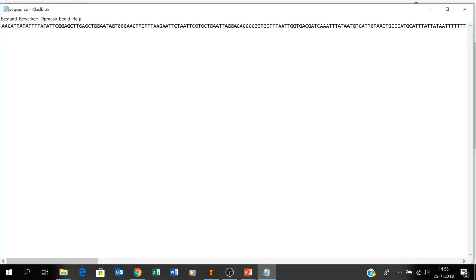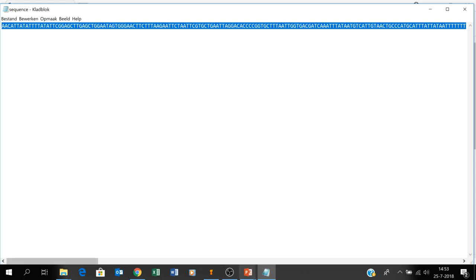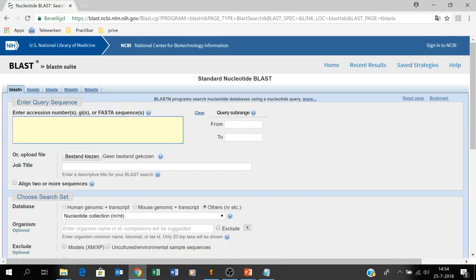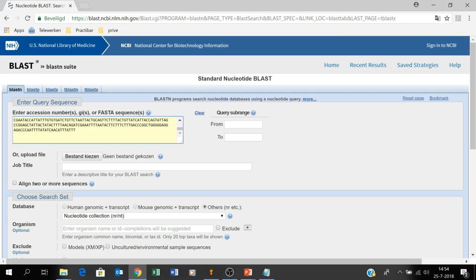I take my sequence from another file and copy it into this field. You can use different sequences at the same time as long as you put them in FASTA format — for instance, you put in sequence one with ATCG below, and then another sequence two below that. In this case we're only using one sequence, so we copy that in and this is our sequence right here.